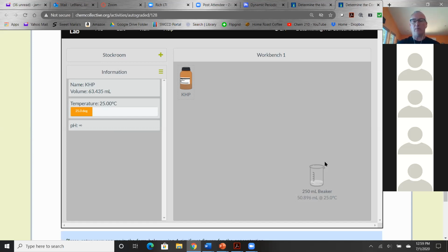So now we know we've dissolved a weak acid in there. It's got 3.28. So it means the pH has gone down. It means we have more H+. It means there must be a weak acid in there.